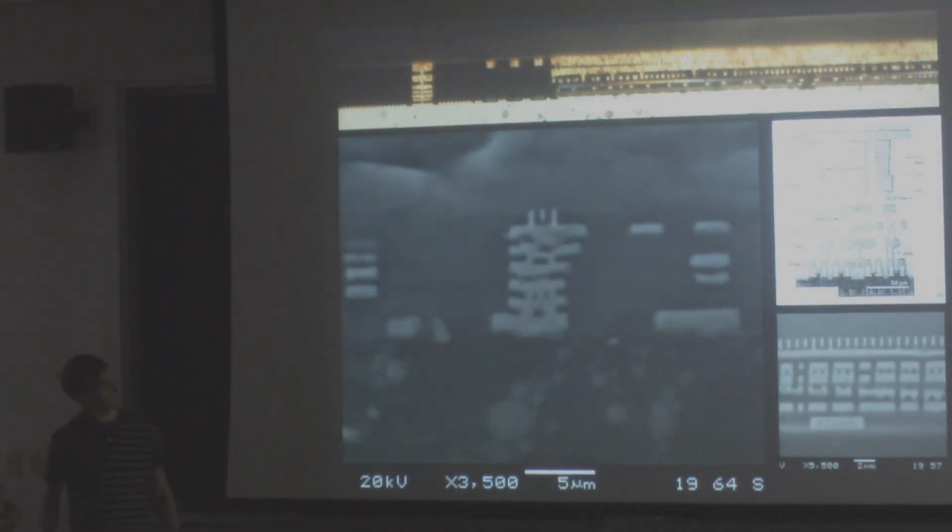So this was something else that we talked about in class that we thought would be important to bring up here. Metal vias, the stacked vias. We saw several pictures of this throughout the course of the semester, and we were actually able to image these. So in the top, you can see something that looks really familiar. We saw a picture just like that way early on in the semester.